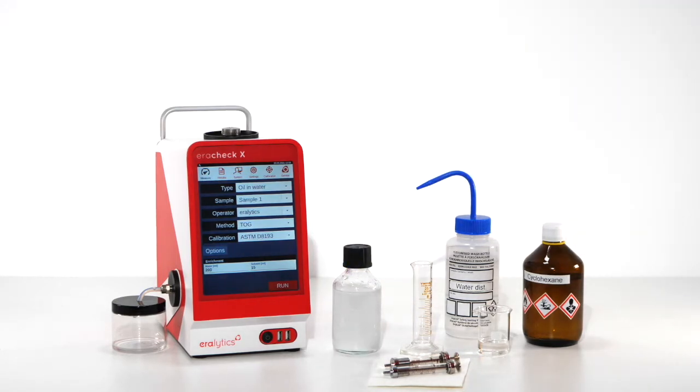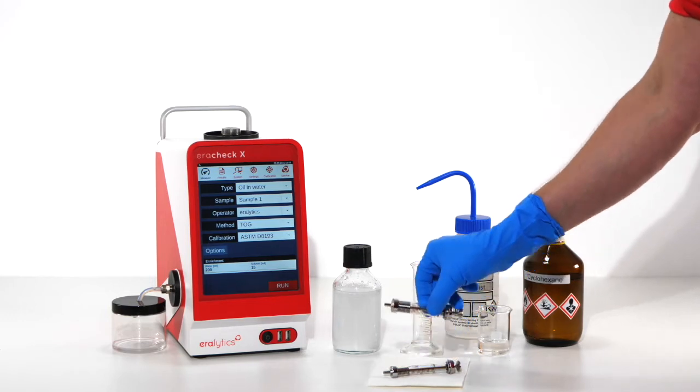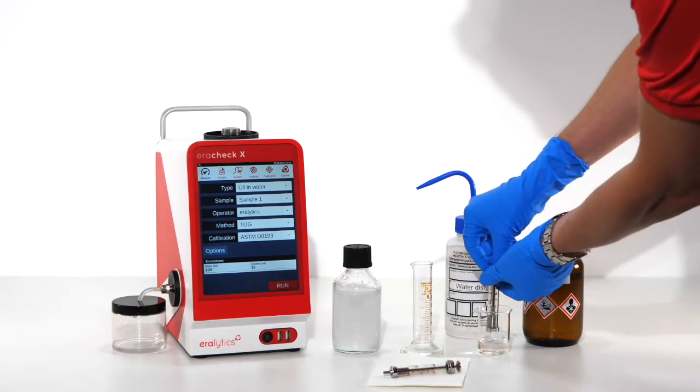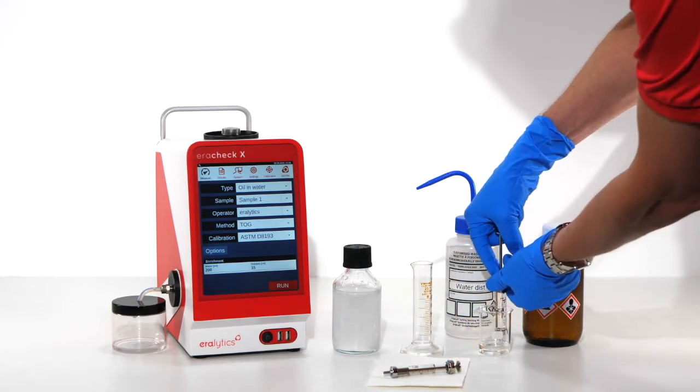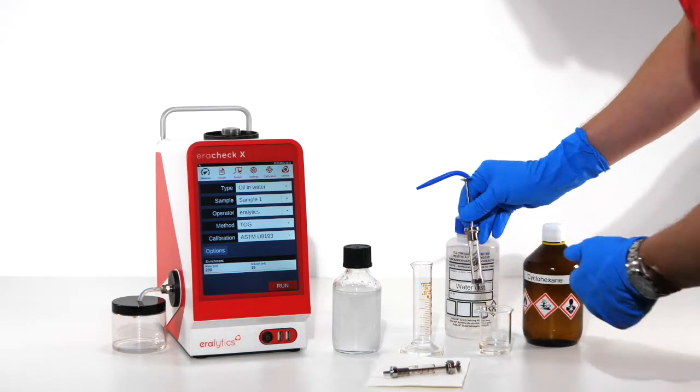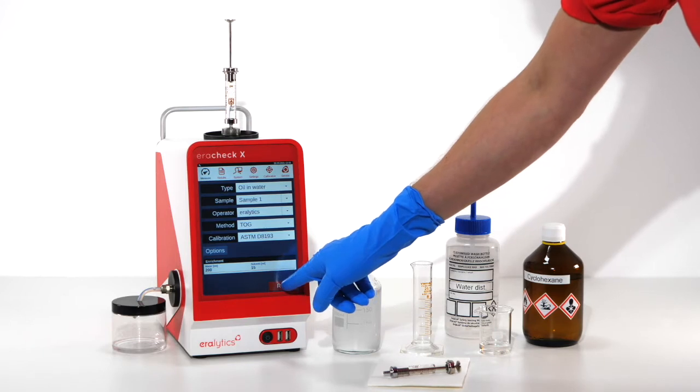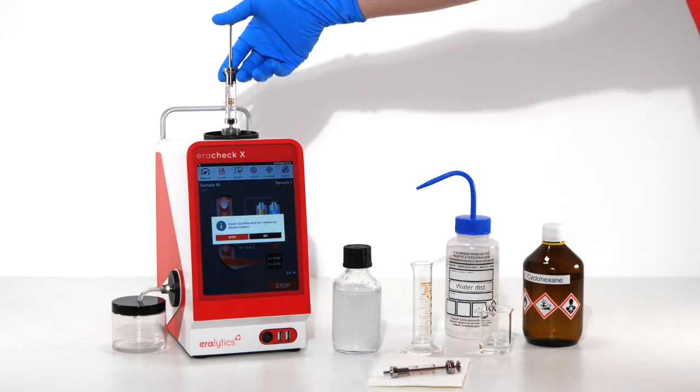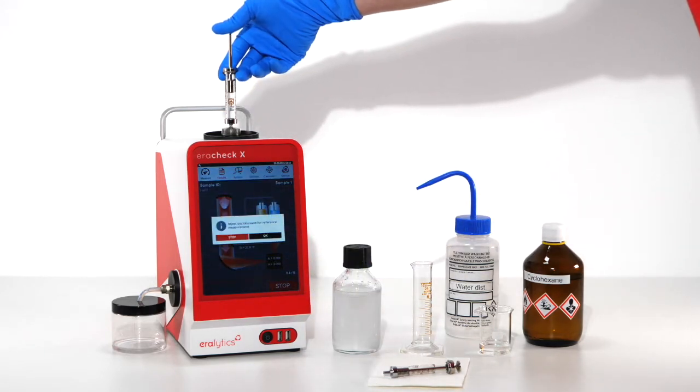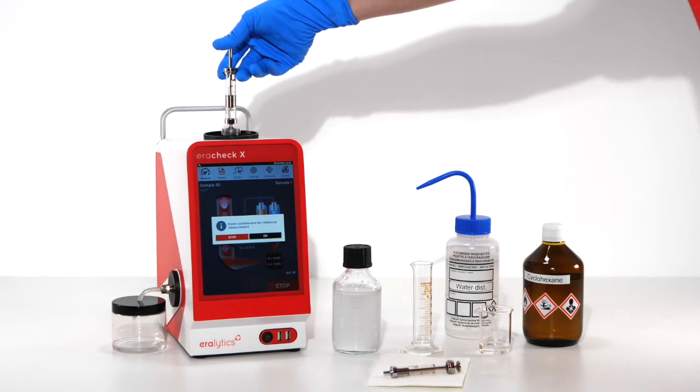In the meantime, use 5 ml of fresh cyclohexane for the background determination. Attach the syringe to the inlet assembly and start the reference measurement by clicking the run button. Slowly inject the cyclohexane into the analyzer and click OK on the screen.